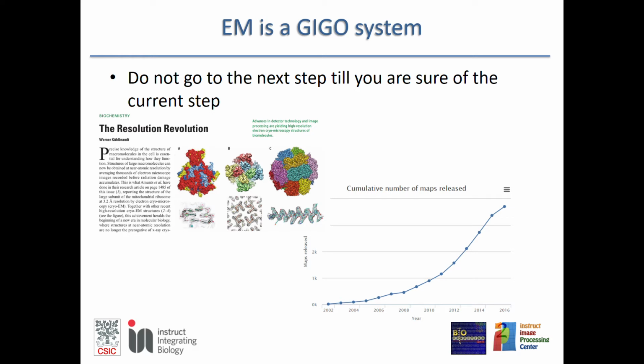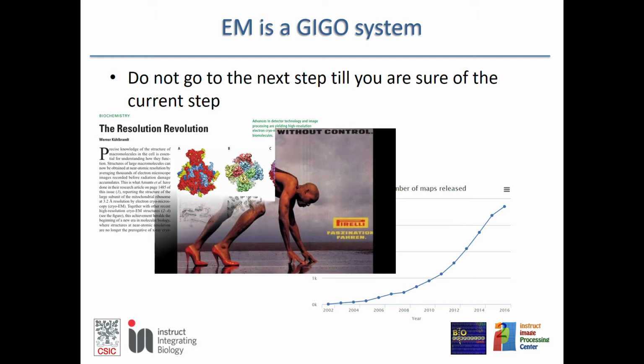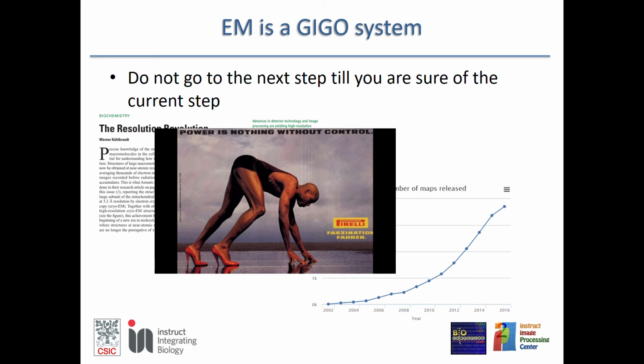And the point is that now this pressure to make good volumes is even harder because we have many more volumes reported. I also like this picture: cryoEM is a very powerful tool, and the image processing tools that you have there are also very powerful, but without control, that is nothing. So you cannot leave them on their own, just hoping that the tools will do their best and always correctly.